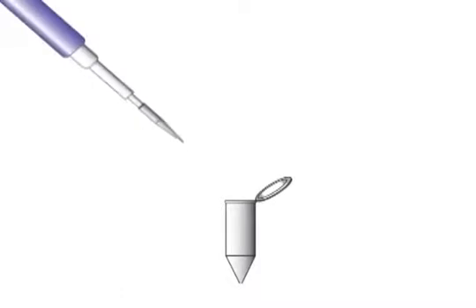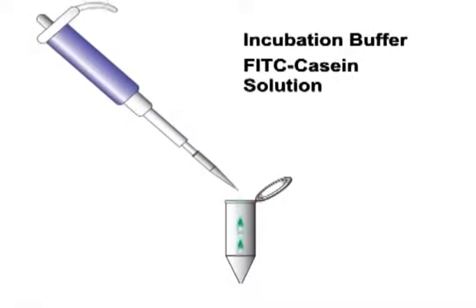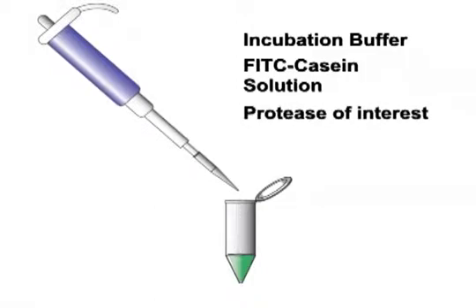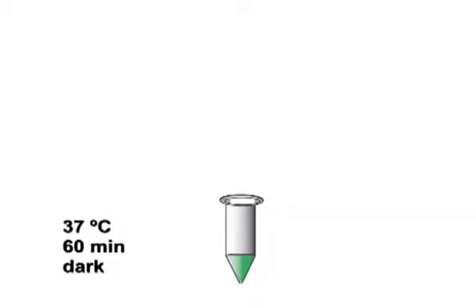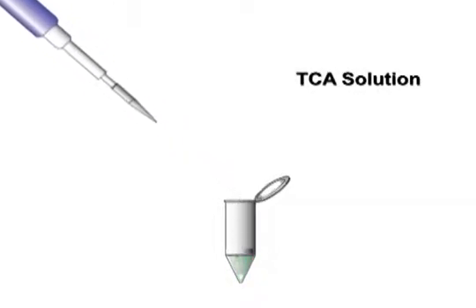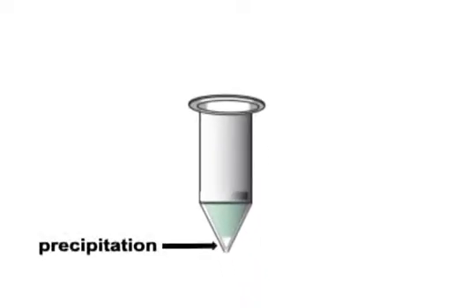This protocol begins by adding incubation buffer, FITC casein solution, and sample containing the protease of interest to a microcentrifuge tube, and then gently mixing and incubating at 37 degrees Celsius for 60 minutes in the dark. To stop the proteolytic reaction at the end of the incubation period, add TCA solution, gently mix, and incubate at 37 degrees Celsius for 30 minutes, again in the dark. This step will cause the unreacted substrate to precipitate.